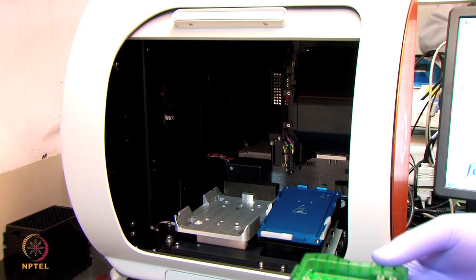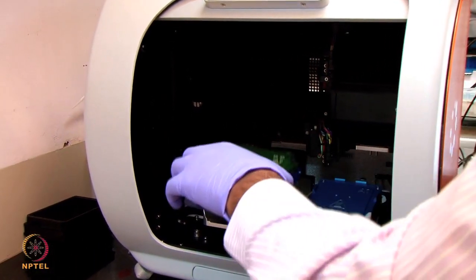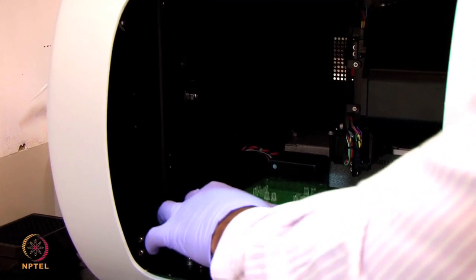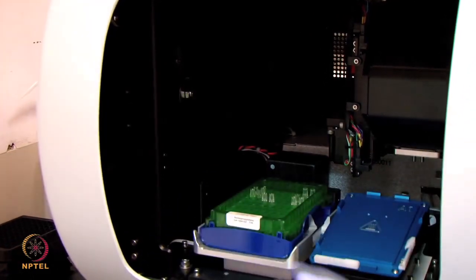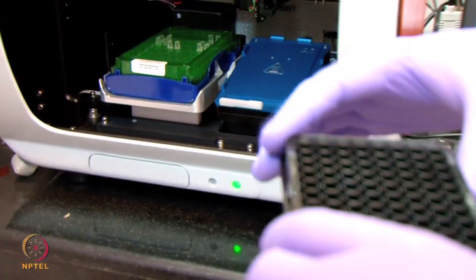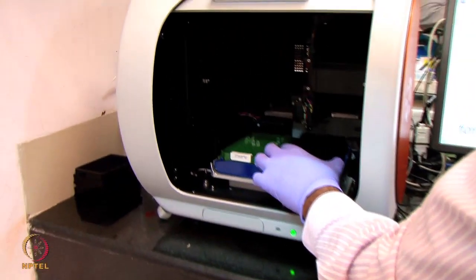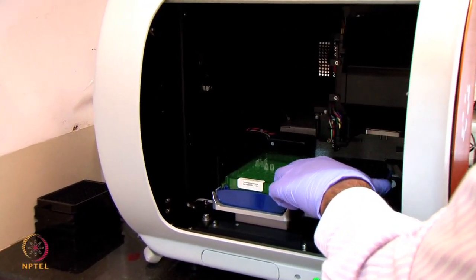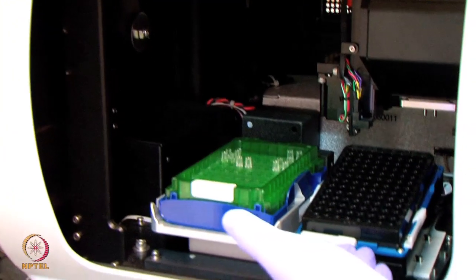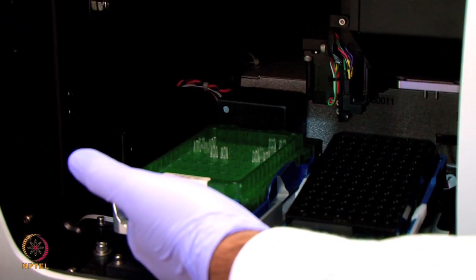Now the sensors are hydrated. I am going to place them in the instrument. The sensor holder I am placing here like this, it should be firmly fixed in the groove. And now I am going to put the sample plate, which contains the biotinylated antibody, like this in the sample tray. This part we call the sample compartment, and this part we call the sensor compartment.